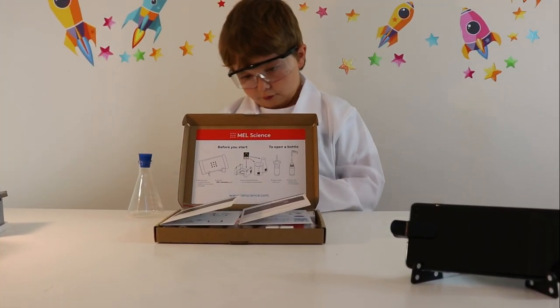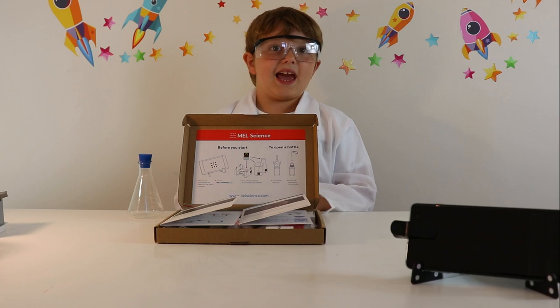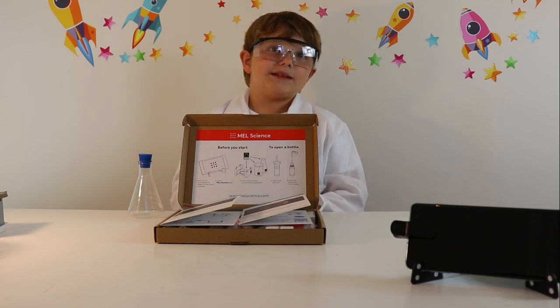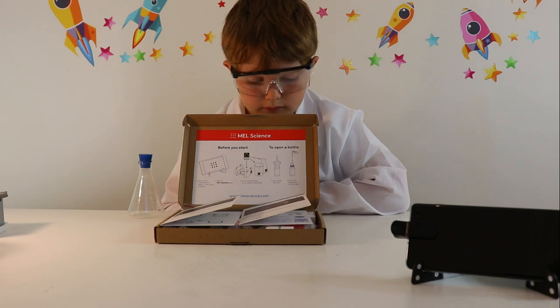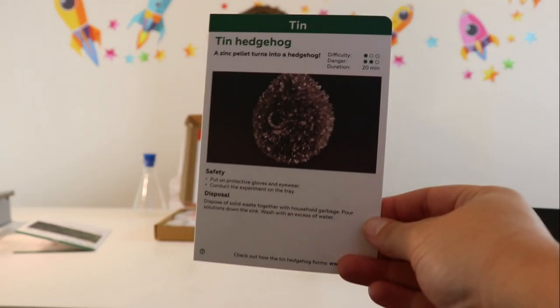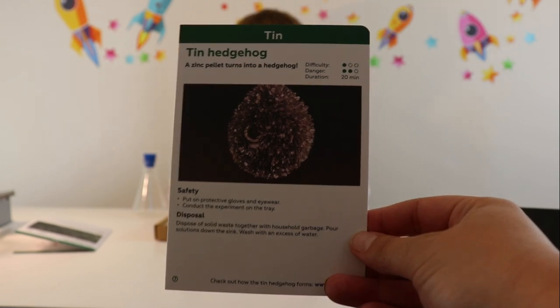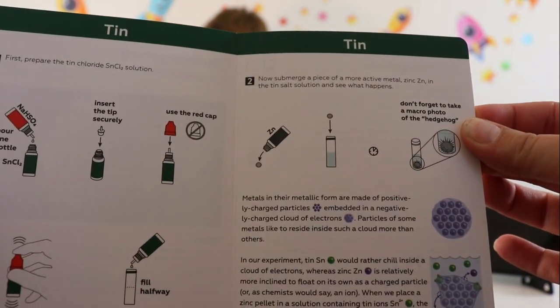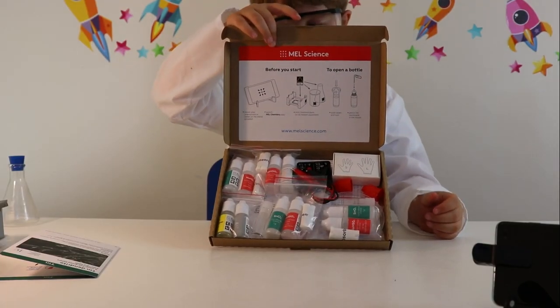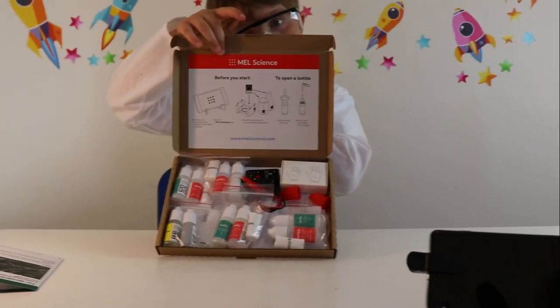So guys, we have unboxed the chemistry kit, haven't we Mummy? We have — and what have we got? So we've got two cards for each experiment. This is our card for the tin hedgehog — it's got safety, difficulty level, danger level, and how long it takes. Then you've got your step-by-step instructions.